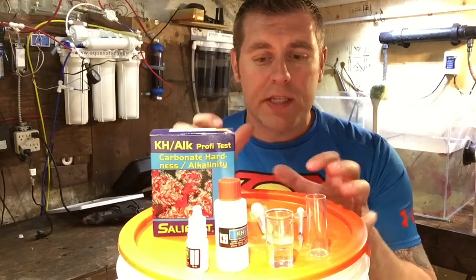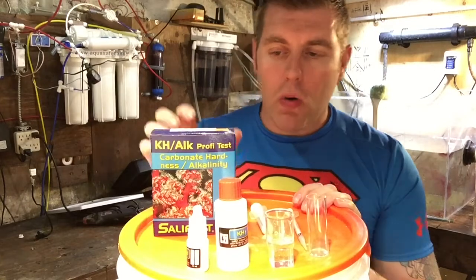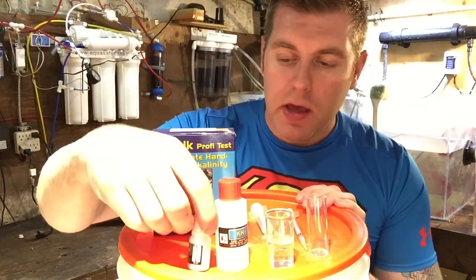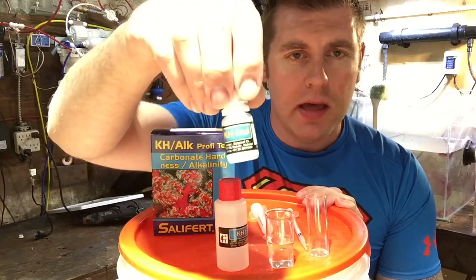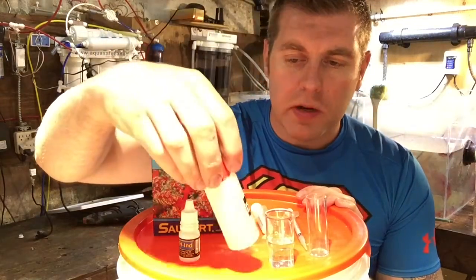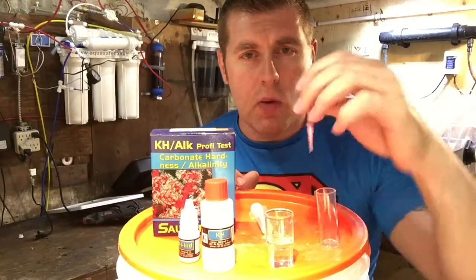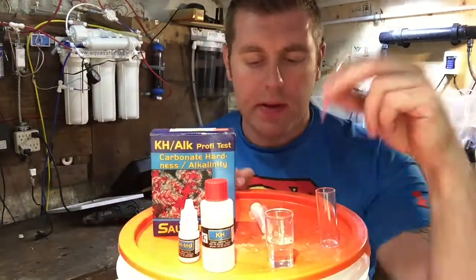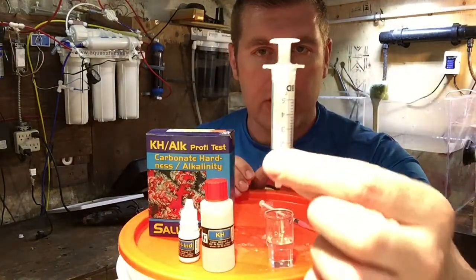On today's episode I'm going to show you what's in the kit and what you need to do. It comes with the test solutions — this is the KH-Ind. This one here is the KH test, and it comes with a vial, a one milliliter syringe with tip, and a five milliliter syringe for your testing.